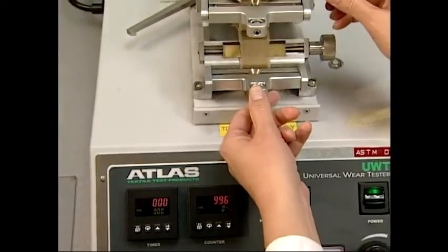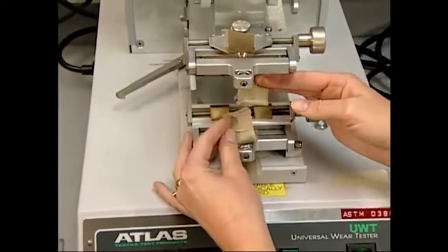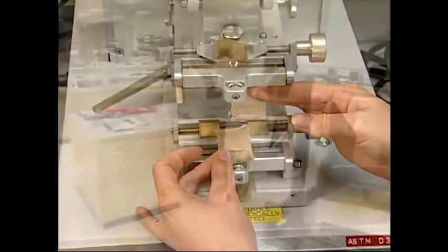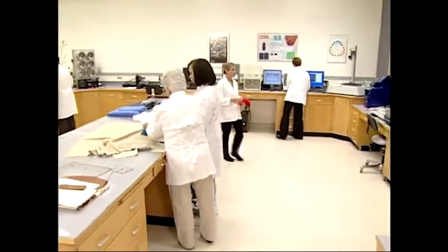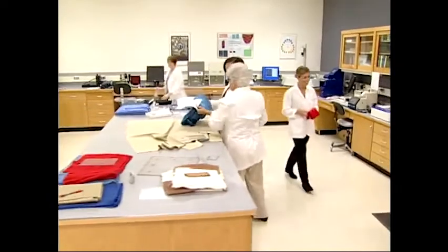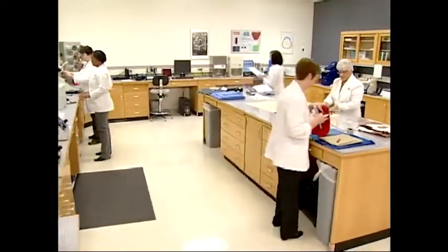Typically, strength and abrasion resistance tests are used to assess product durability and safety. There are no universal standards for textile and apparel products. However, customers and suppliers agree to levels of satisfactory performance that individual products and their end users must meet.